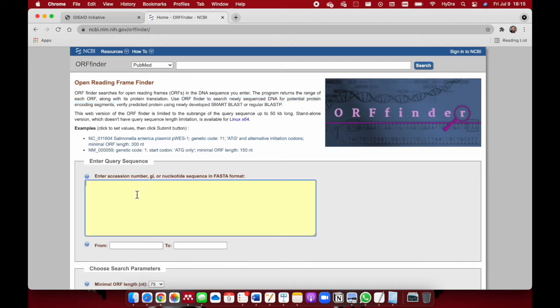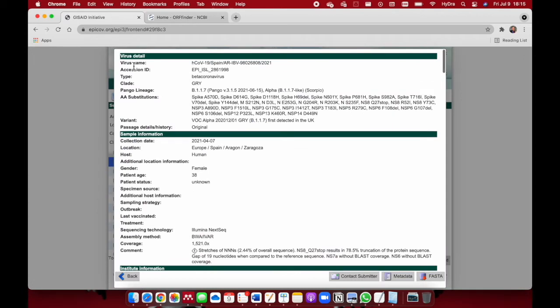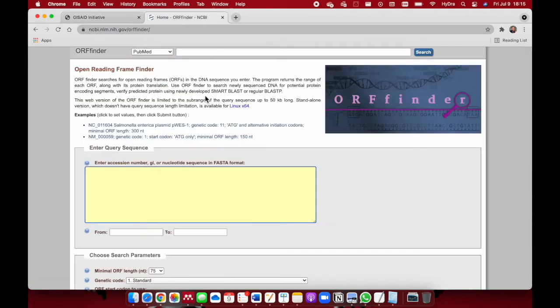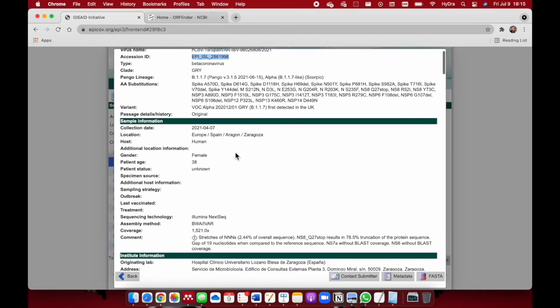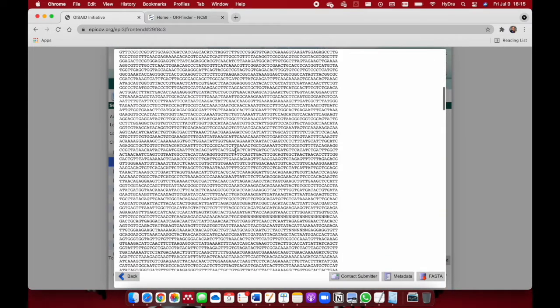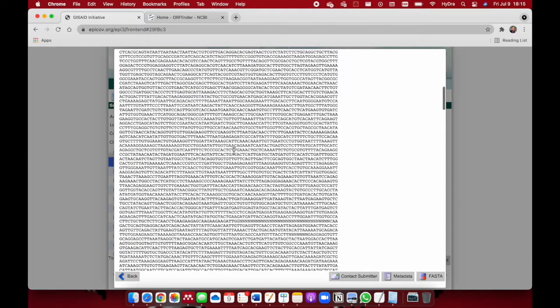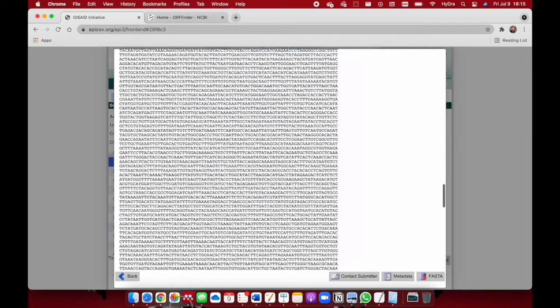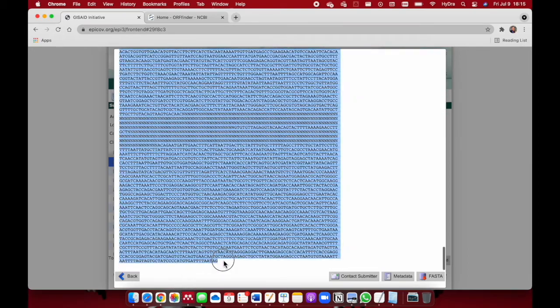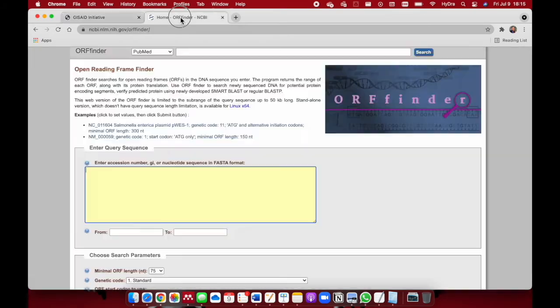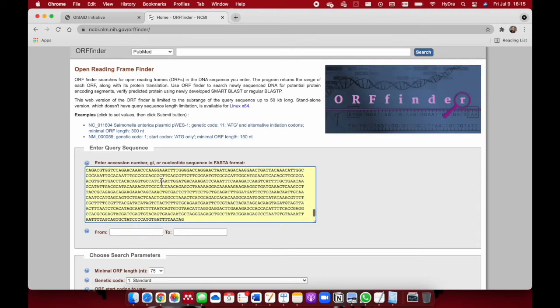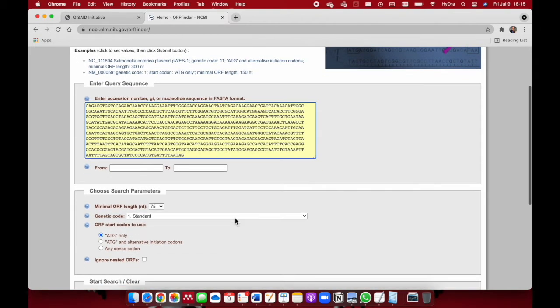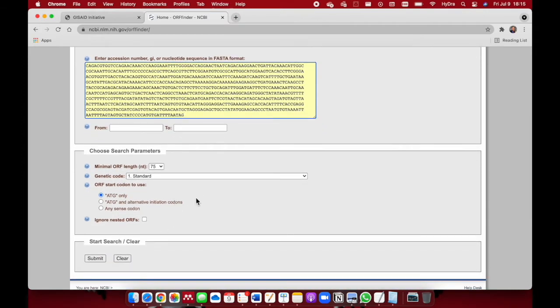Here is where you enter either the accession number or the sequence. If you want to enter the accession number, you cannot use the GISAID accession number. Instead, you have to use an accession number from NCBI. Since we don't have the NCBI accession number yet and don't know if this sequence has been uploaded to NCBI, we're just going to copy this entire sequence from here. Copy and paste it right here. We leave all of these options in default and submit.